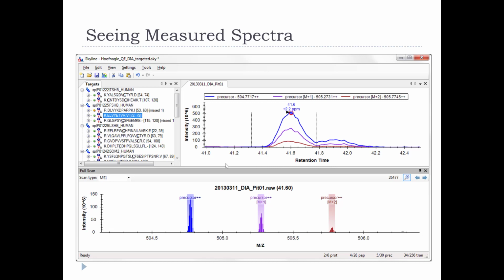Can anybody tell me what this is? I'm denying you the information of what it is. Any hypotheses? Is that an interference? Is that a tail? Is it that the instrument hasn't been calibrated? Sometimes there's a shift, or the column is contaminated.